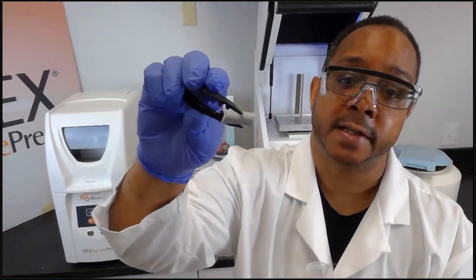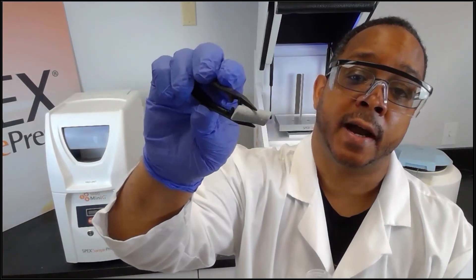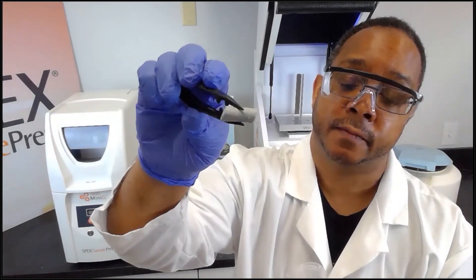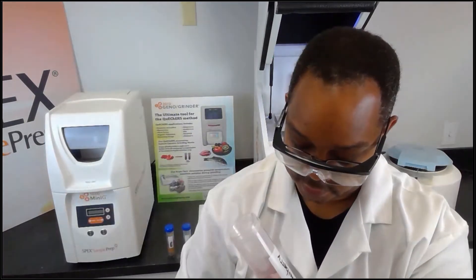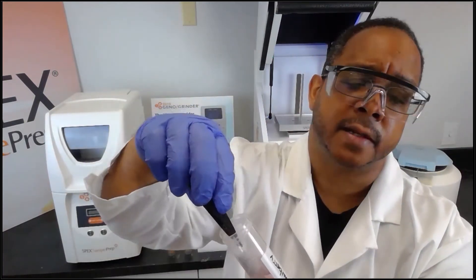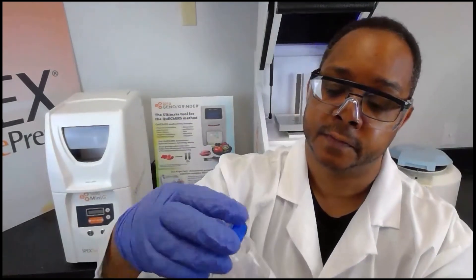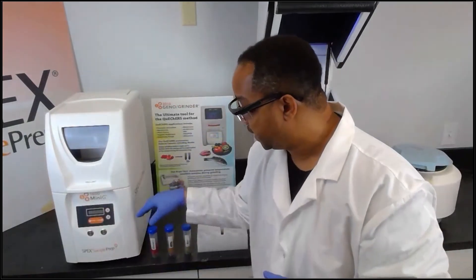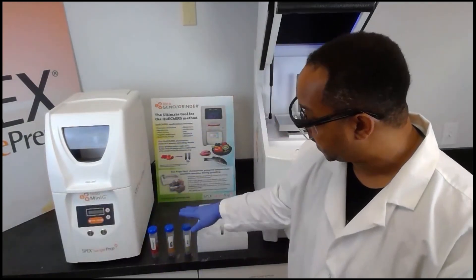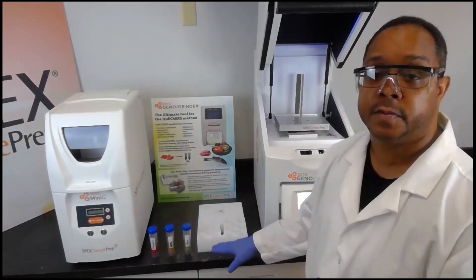We also highly recommend the ceramic cylinders, which are angular or wedge-shaped — they do a great job of homogenizing the sample. We want to add two cylinders to the tubes; in some cases you can add three depending on the fruit. We then want to close the tubes off.